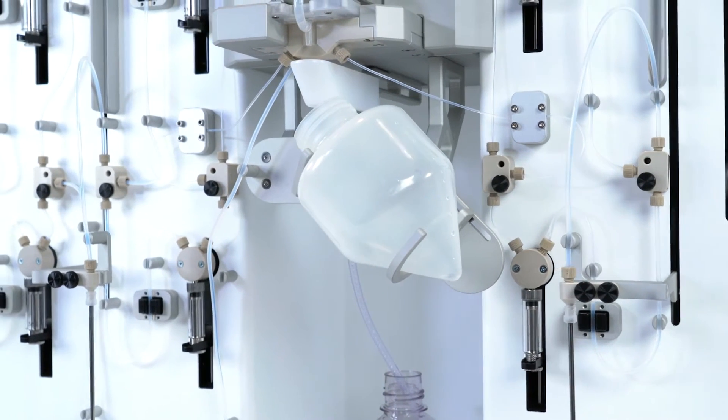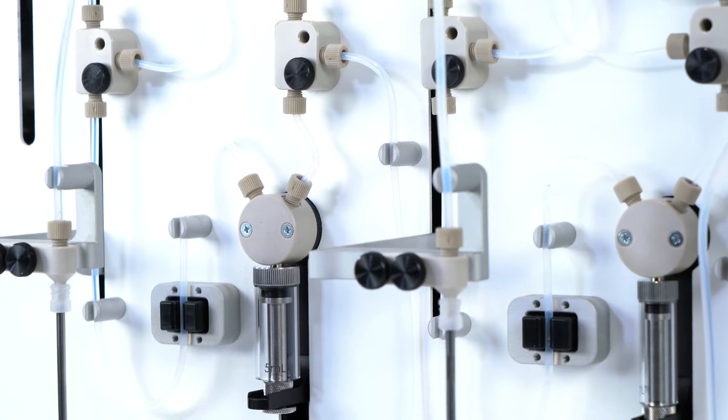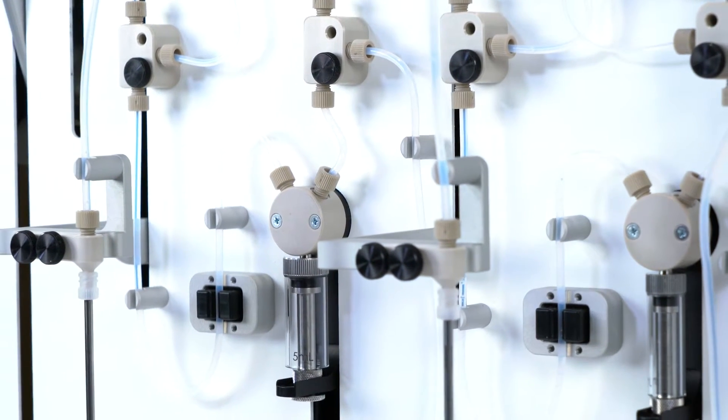The Blaze instrument utilizes continuous flow to manufacture volumes from as little as 10 milliliters to as high as one liter in the same pumping format.